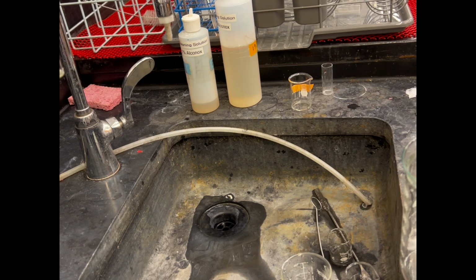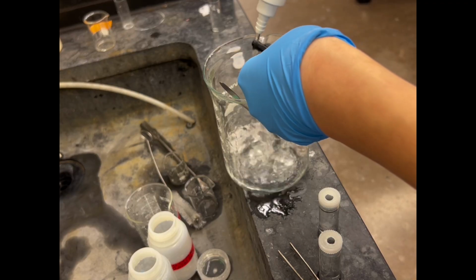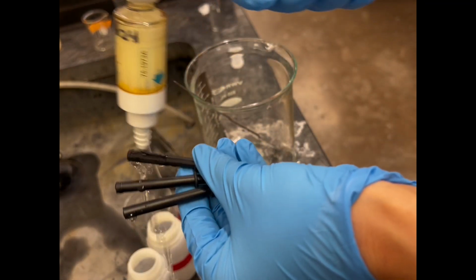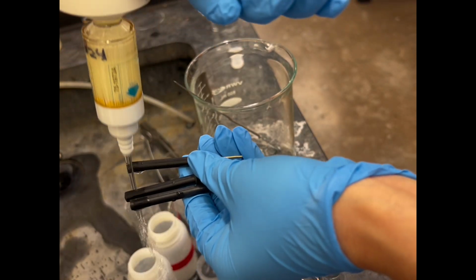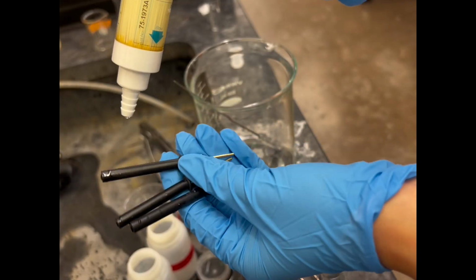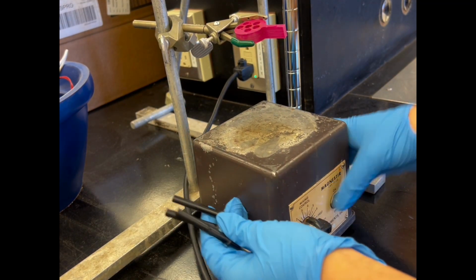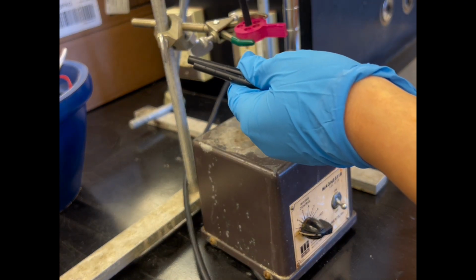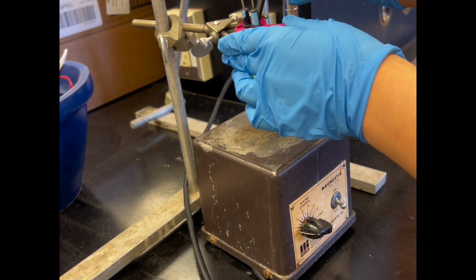We'll rinse the PFAS waste into the waste beaker for the first rinse. After that, it is okay to dispose of the rinse water into the sink. For the rinse before template removal, please do not dry it with nitrogen gas. And we just take it to set up for the template removal step.